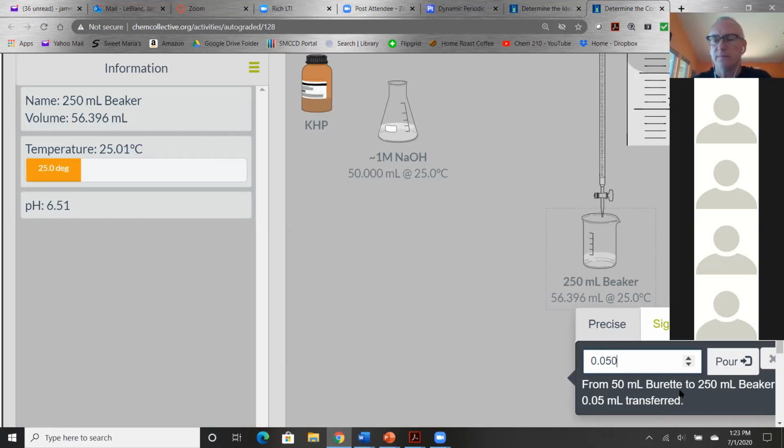So it's super close. I noticed that my pH level is not the same as yours. Is it different for everybody as well? It would depend on the volume of water you used. If you use more water, the pH will change less. If you use less water, the pH will change more. I use the same amount as you. Oh, okay. How different is it? I may have just added more or less than you have at this point.